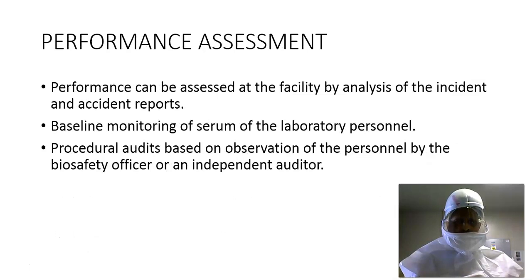Performance assessment. Performance can be assessed at the facility by analysis of the incident and accident reports. Baseline monitoring of serum of the laboratory personnel will also provide an indication of the degree of risk mitigation. Procedural audits based on observation of the personnel by the biosafety officer or an independent auditor also provide the relevant assessment of performance.